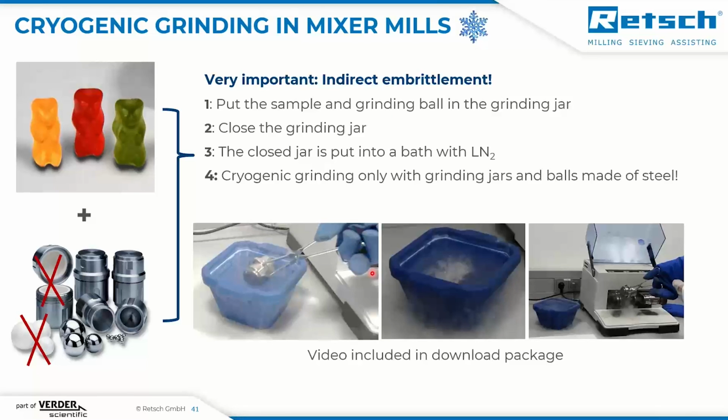for at least 1 or 2 minutes. And then we maybe need some intermediate cooling in the liquid nitrogen bath if longer grinding times than 1 or 2 minutes are required. Very important, please only use stainless steel equipment, not the zirconium oxide jars, for example, as the very cold temperatures would lead to different behavior of the zirconium inlay compared to this stainless steel jacket. This will cause some wear over time. So we just recommend to use stainless steel equipment for cryogenic grinding in a mixer mill.